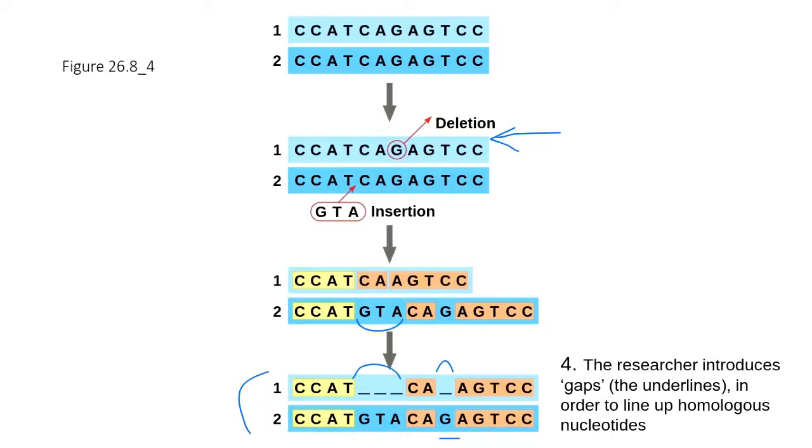So that's an alignment. Again, you're going to download the file that is not aligned, just sequences all together. You're going to press a button and get yourself an aligned file, and that's the file that you will have to use to build the phylogenetic tree. You will save it in a special format for MEGA. You will name it coronavirus aligned, and that's the file you will have to use for the tree.